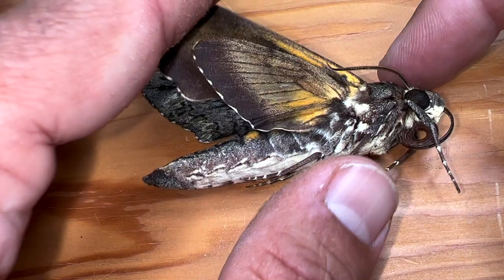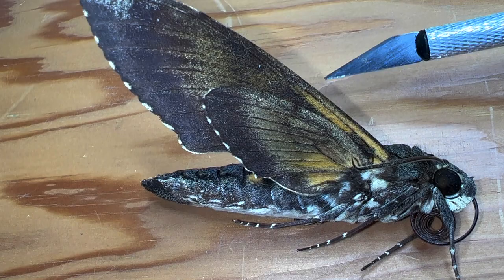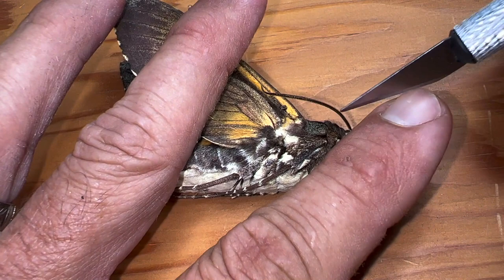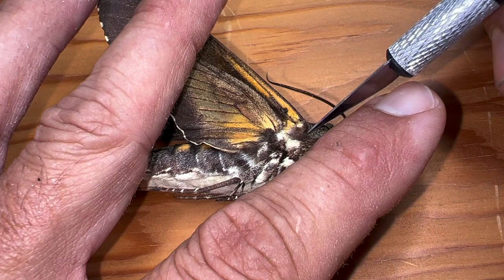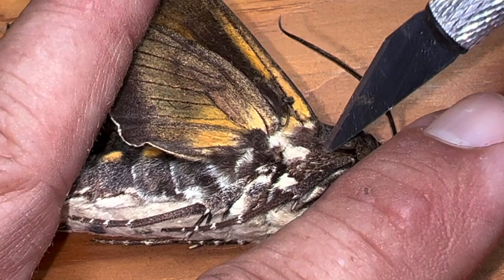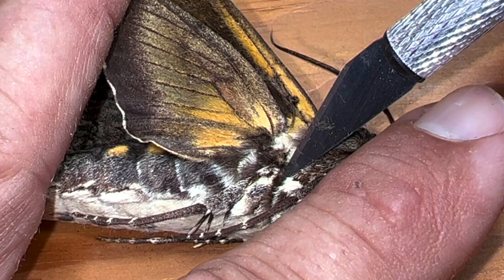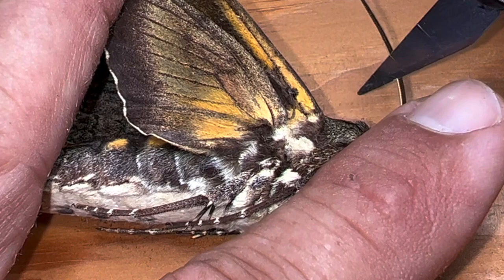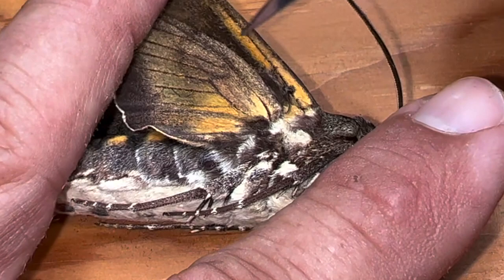I have my giant sphinx in hand, and I'm going to use this exacto knife to do a little surgery on this moth. This is going to take some getting used to, so don't expect to understand it on the first go. You have to sever these tendons — there's a tendon that attaches the forewing to the thorax, and a tendon that attaches the hind wing to the thorax. If you learn that anatomy and sever both tendons on both sides, it'll make mounting your sphinx moth much easier.